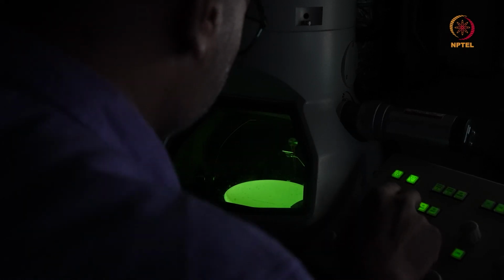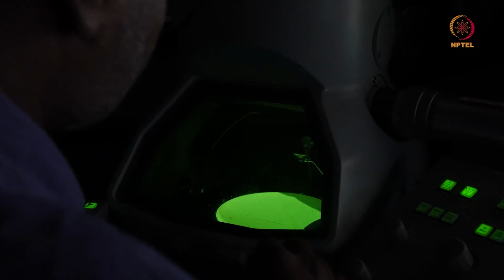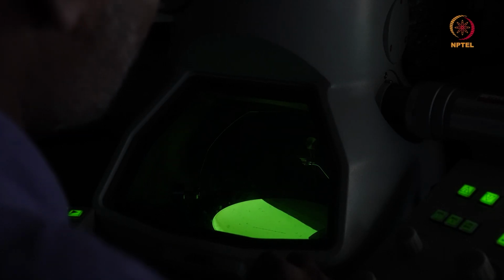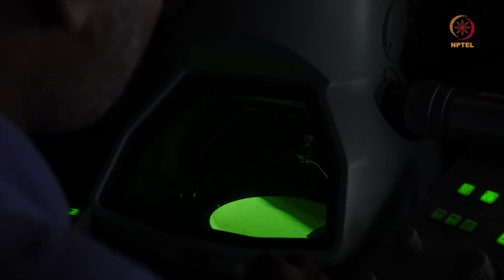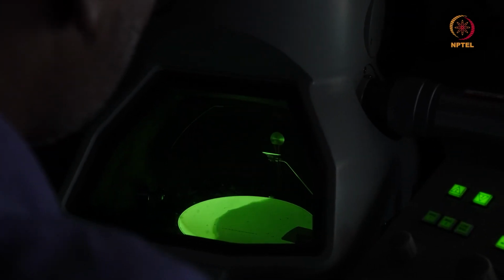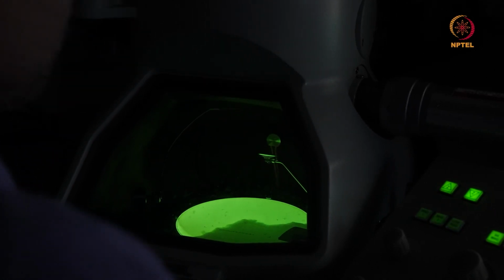I go to the SA mag mode on this instrument, and we find an electron transparent region. Now the first thing that we do is we bring the specimen to the right height. So I'll just search for a small area, and hopefully this is slightly more transparent than the other.